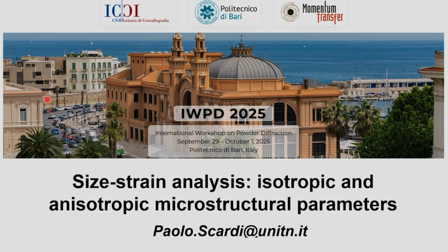Good morning again. And today I will try to show you some features which are used in most line profile analysis. And it's a little bit like the first part of the talk, a little bit like a travel in the sausage factory. So I will show you what is in the sausage. The second part will be more special for using these methods. And I will also try a little bit of a hands-on session with you.